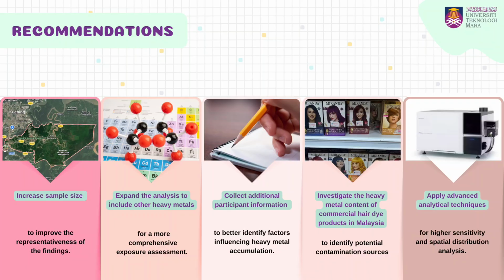Future research should analyze more heavy metals and use additional biological samples such as blood or urine for a more comprehensive exposure assessment. Advanced techniques such as ICP-MS or LA-ICP-MS could also be used to improve analytical sensitivity. Finally, commercial hair dye products sold in Malaysia should be analyzed to identify possible sources of heavy metal contamination.